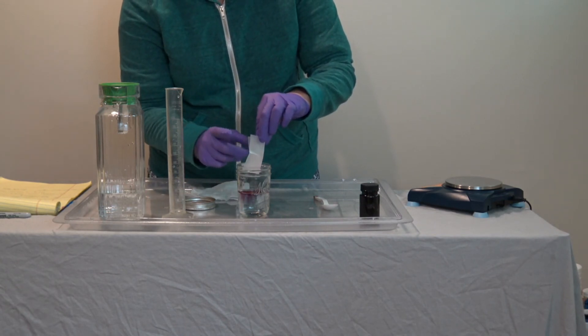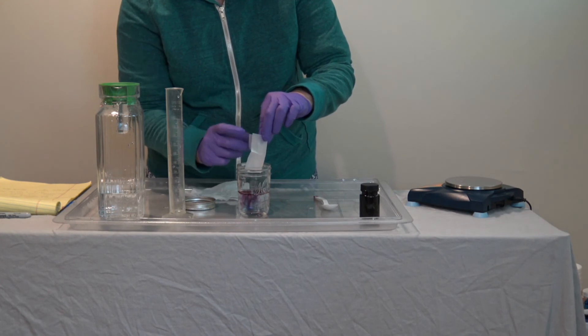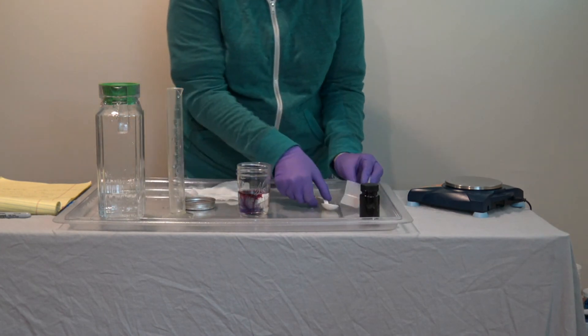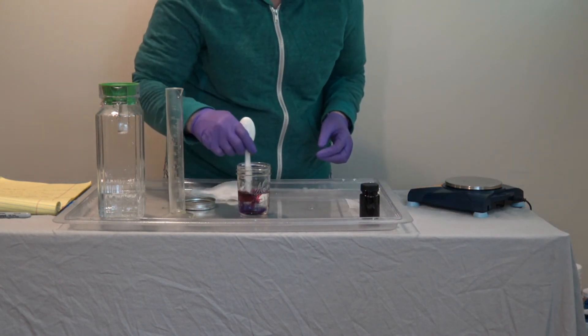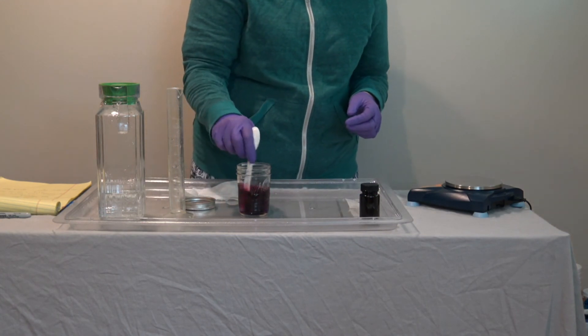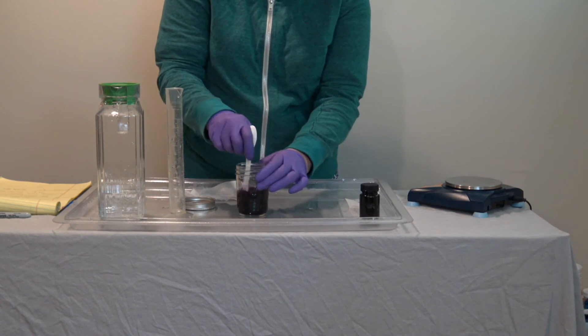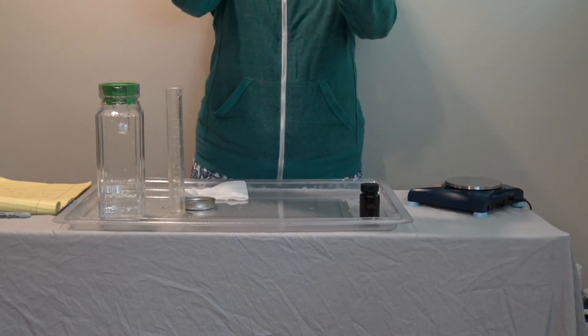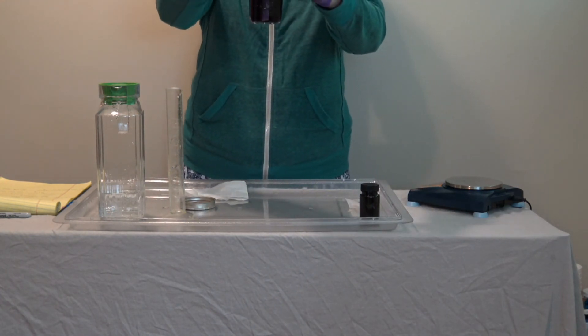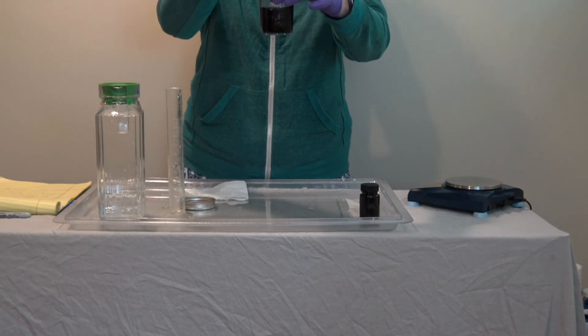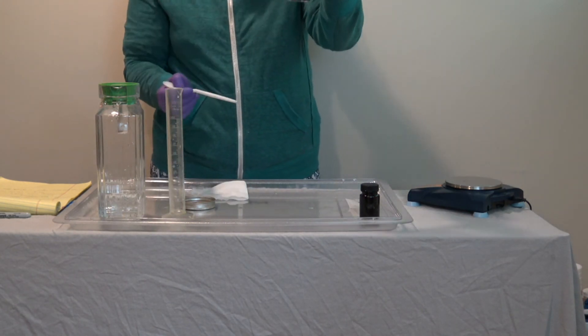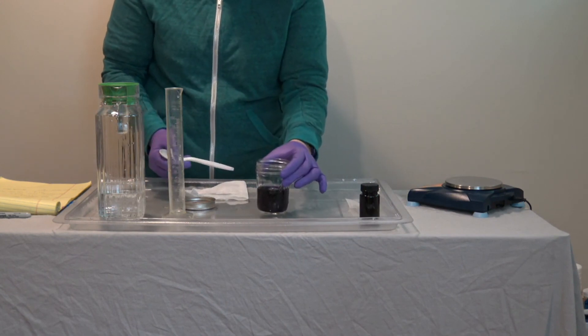I'm just going to tap this paper to get as much off of there as I can. And then I'm going to use this end to thoroughly mix until I'm sure that all of the powdered cabbage juice is dissolved, and it looks like it's dissolved. You're going to get a really dark purple solution.